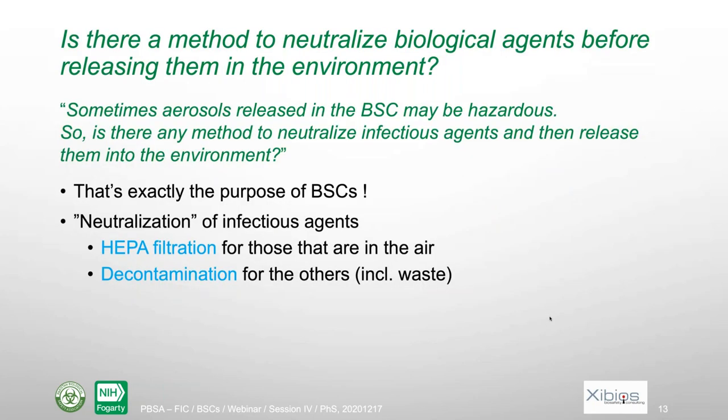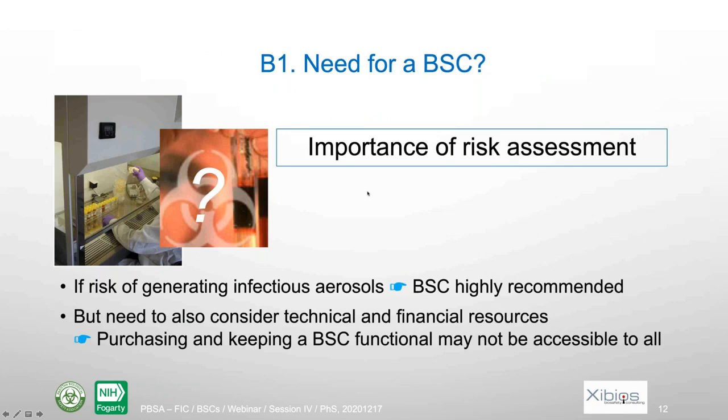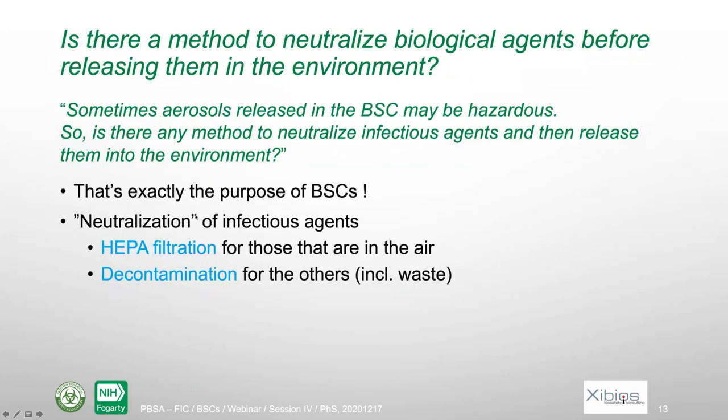The first question there is: is there a method to neutralize biological agents before releasing them to the environment? And the actual complete question is there. So actually, that's exactly the purpose of the biosafety cabinet. It's to get rid of the biological agents in aerosols.